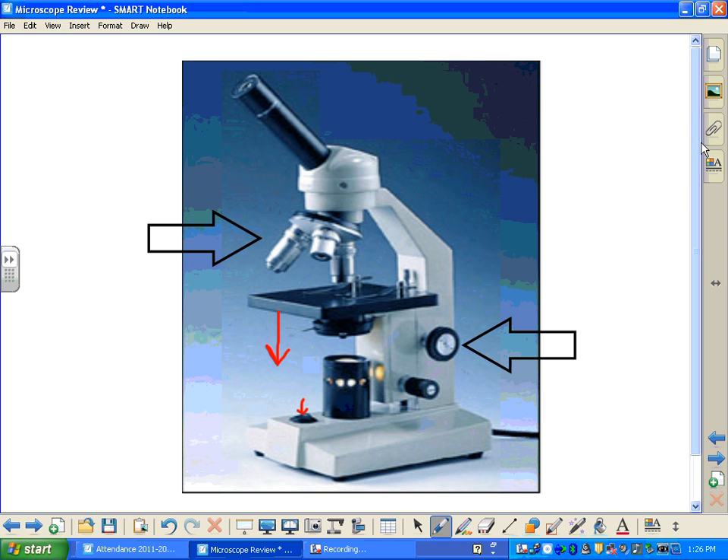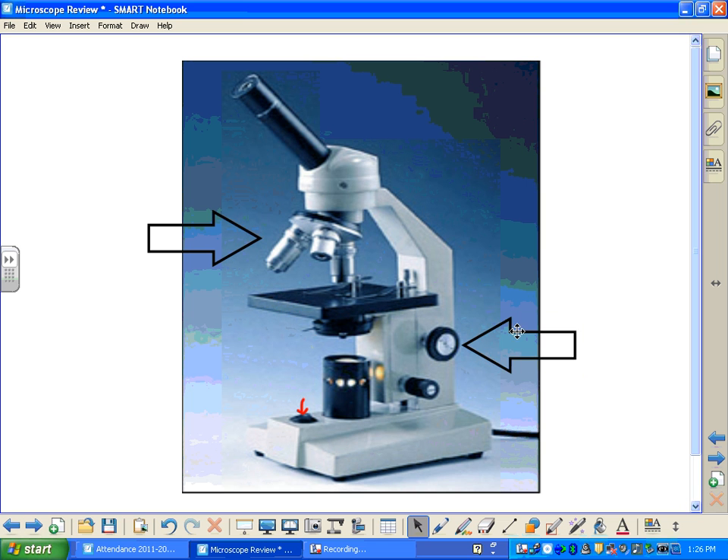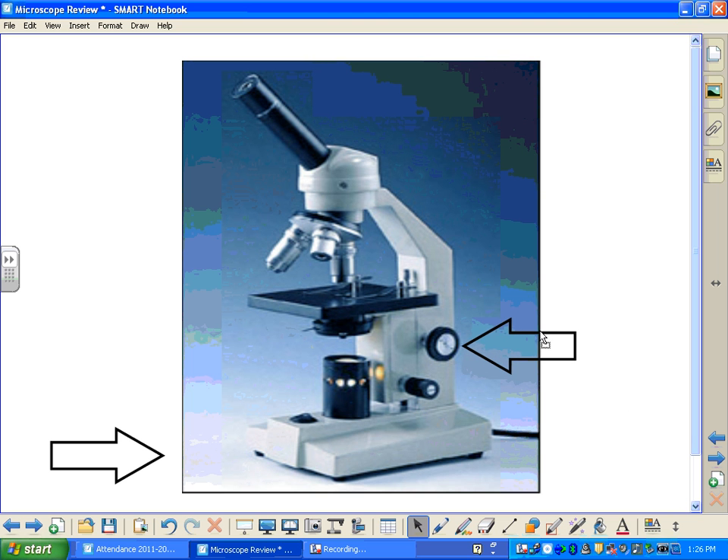Let's go through some questions — we'll start with some basic parts. Question number one: you may want to pause at this point to take out a piece of paper. What is the name of this part of your microscope? You may pause to answer.